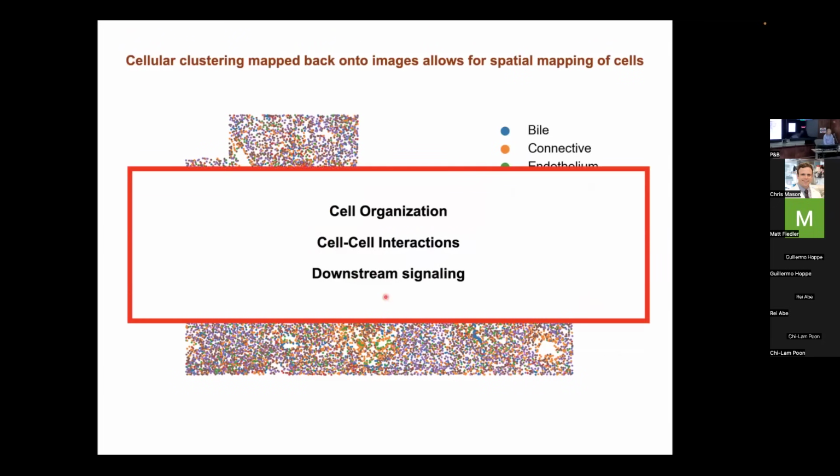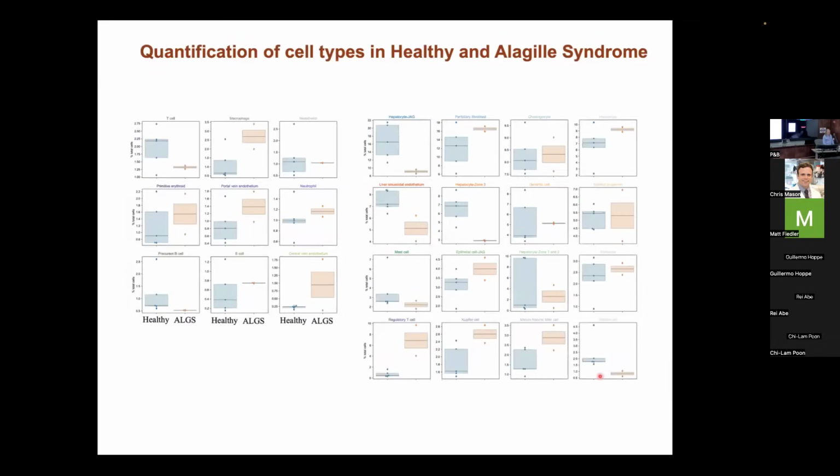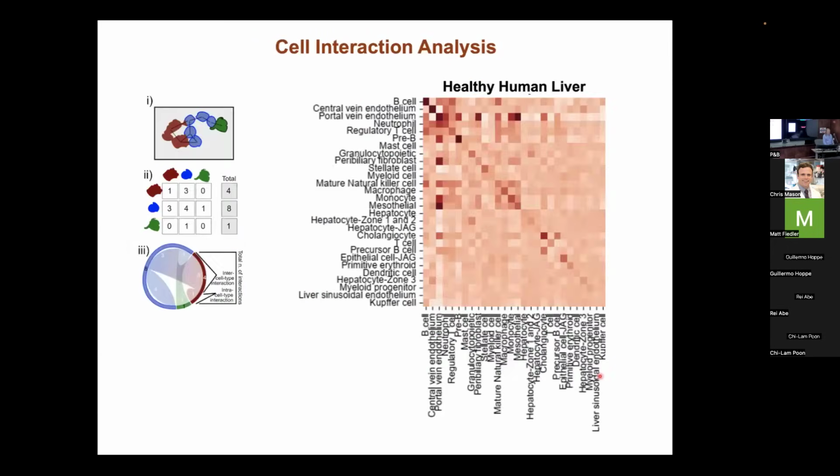And basically, this is what the disease tissue looks like, and I know this is looking at very large groups, but we're actually able to delineate 14 different cell types within the liver tissue, even using just a 100 RNA plex technique. So imagine as we move to 1,000, 10,000 type RNAs, it's really going to allow a lot more depth. Now, obviously, this is in a very well-studied tissue that we've put a lot of effort into delineating the different populations using single nuclei RNA-seq.